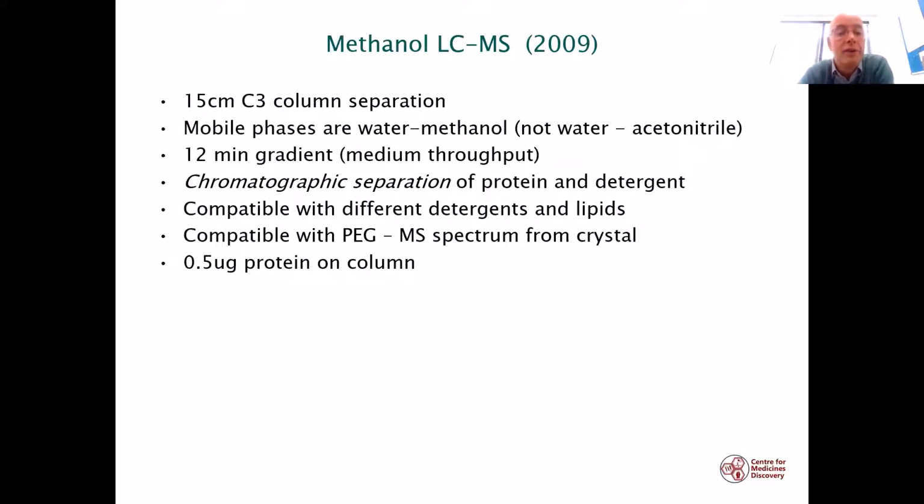So we found this method is compatible with different types of detergents and also different lipids. And interestingly, it's also compatible with polyethylene glycol. Now, this is another ion suppressant, and very fortuitously, it also enables separation from that, which is very useful because polyethylene glycol is very often used in your crystallization liquor, and it's possible to take a crystal, shoot the crystal in your X-ray source, get your structure, and then from the same crystal you can obtain a mass spectrum, so you know exactly what it was that you shot in your crystallography experiment.